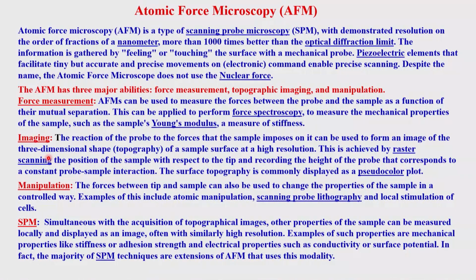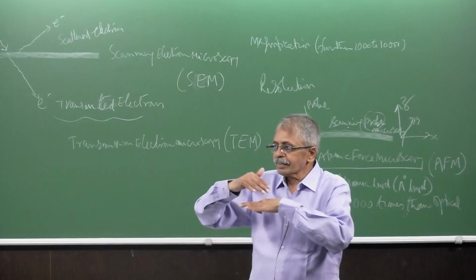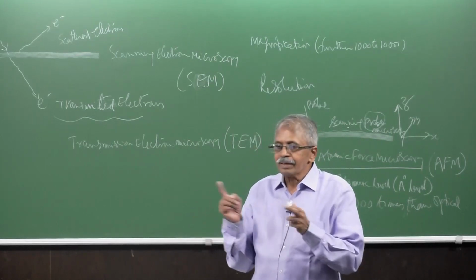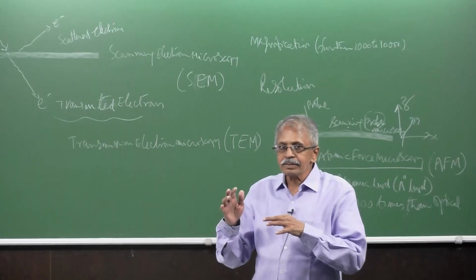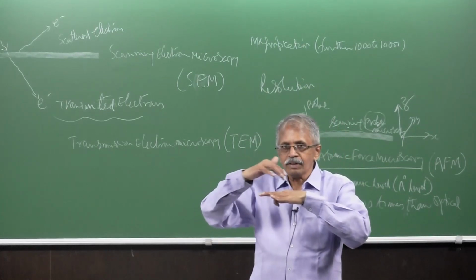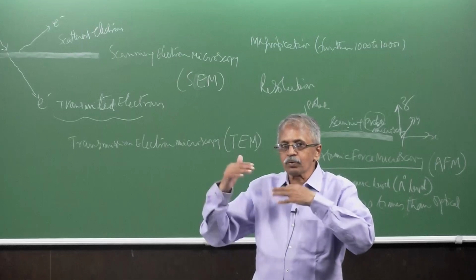Then the second point is the topographic imaging. Because when it moves, there is a reaction between the tip and the surface. Because of these forces and those reactions, you're measuring them in the form of some kind of a signal. That could be a deflection, or you fix the movement of the scanner or the probe, and measure how much feedback power is required to control it.